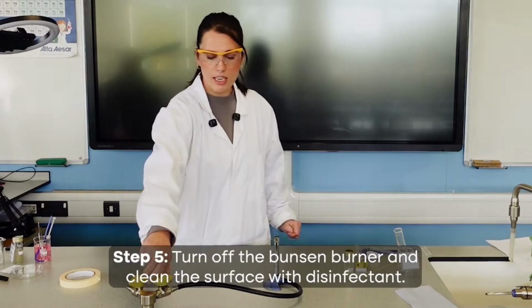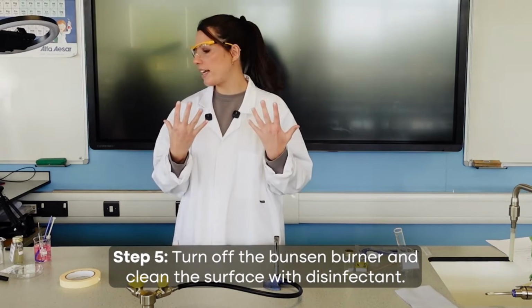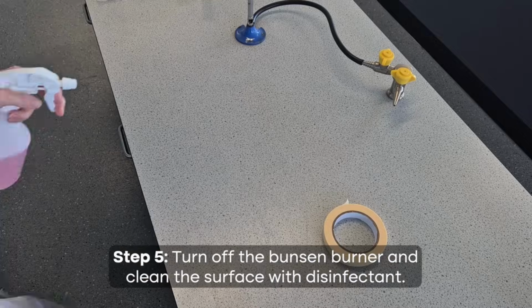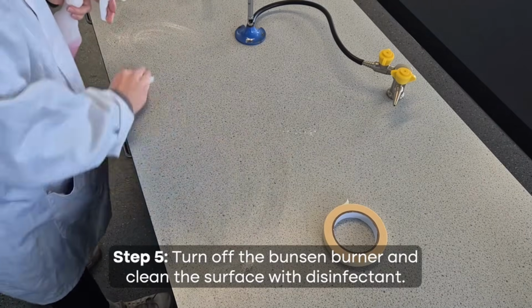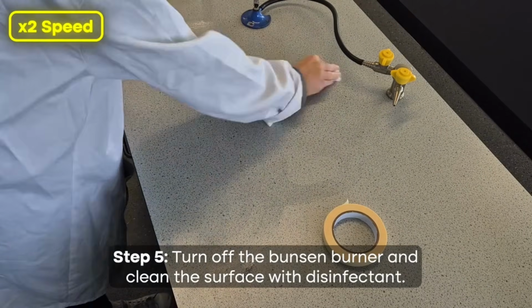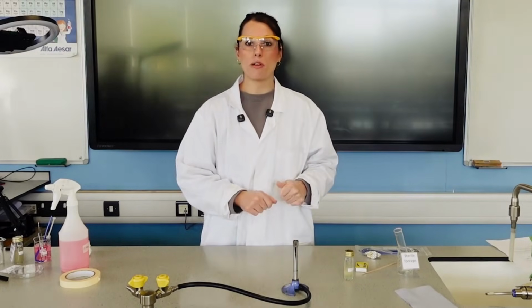So final step, I'm going to turn off the Bunsen burner and then we need to clean the surface with disinfectant and wash our hands with soap again. So there we go, just clean down the area that I worked. And I'll then be washing my hands with soap also.